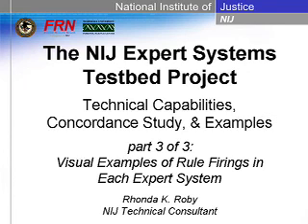The goals of the project are to evaluate the commercially available expert systems designed for the technical review of single-source data produced by forensic DNA laboratories, and to report the results to the forensic DNA community. This podcast represents the conclusion of the presentation, visual examples of rule firings in each system. Your presenter is Rhonda Roby, a technical consultant for the NIJ.